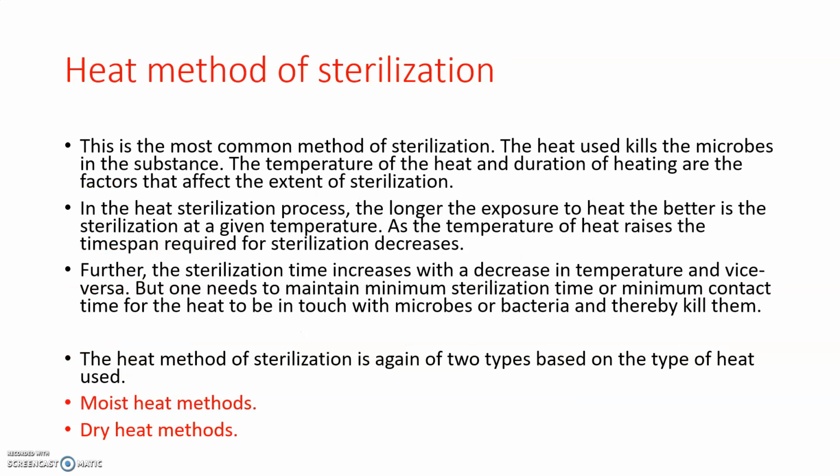Next is the heat method of sterilization. We can discuss each of them in detail. So in this session we are going to discuss heat methods of sterilization, mainly dry heat methods. In today's session we are discussing dry heat methods.